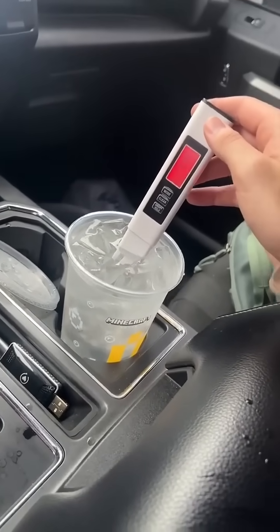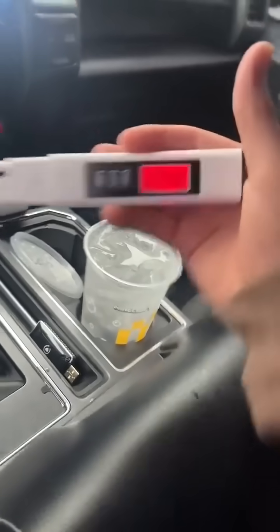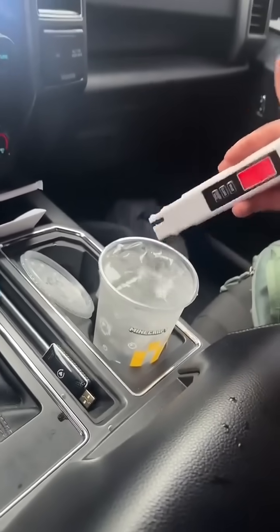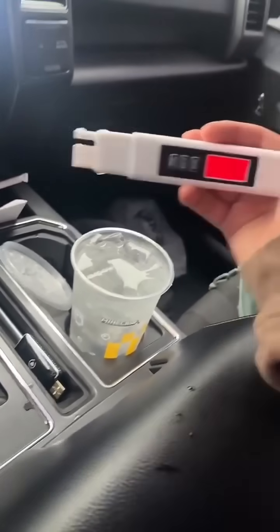Okay, that's 100% tap water, if not worse. This is exactly why you need to be testing your water before you drink it, no matter where you're at. So many places, including our own tap water in our home, is not filtered. Make sure you get a filter and something to test your water when you're on the go.